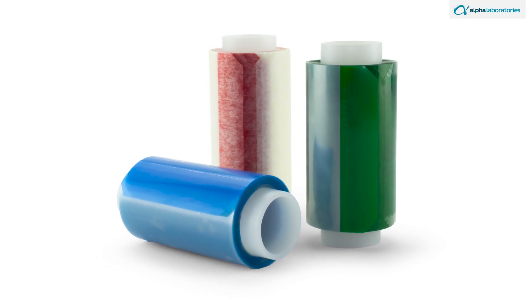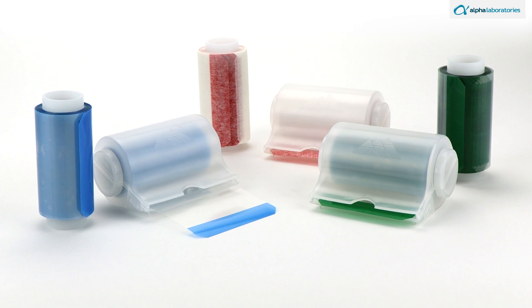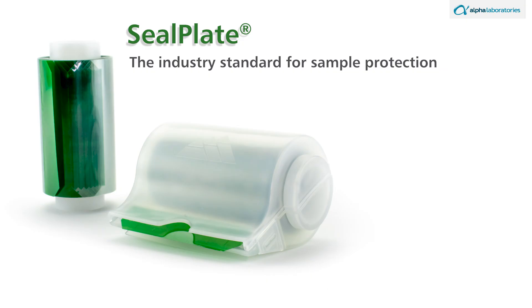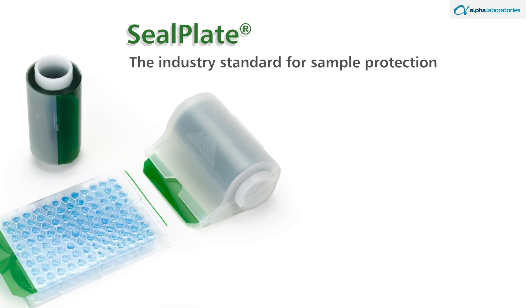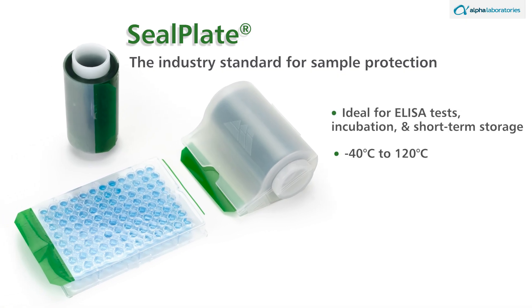Seal Mate offers three compatible options for your specific laboratory needs, available as entire systems or refill rolls. Green coded Seal Plate 50-micrometer polyester films provide a secure, non-pierceable seal, minimizing evaporation, preventing spillage, and avoiding contamination between wells. Ideal for ELISA tests, incubation, and short-term storage, they are effective from minus 40 to 120 degrees Celsius. Each green coded roll covers 100 microplates.